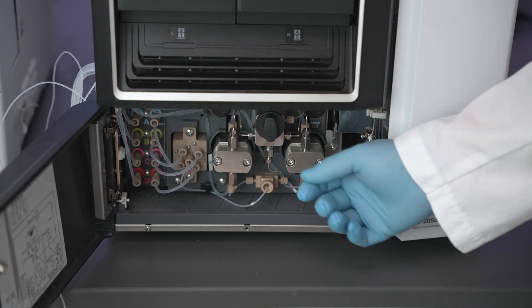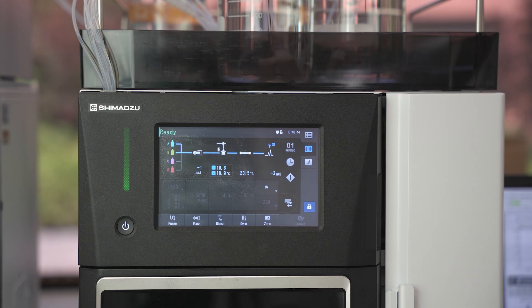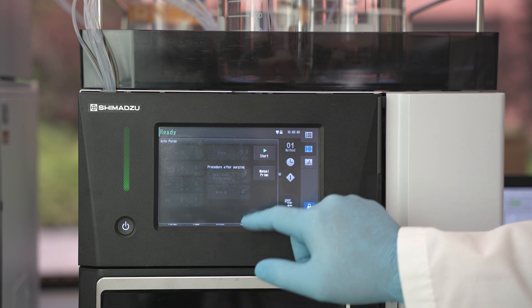Open the black drain valve in the pump section counterclockwise 90 degrees. Using the touchscreen, click on the purge button, then click on the manual prime button.